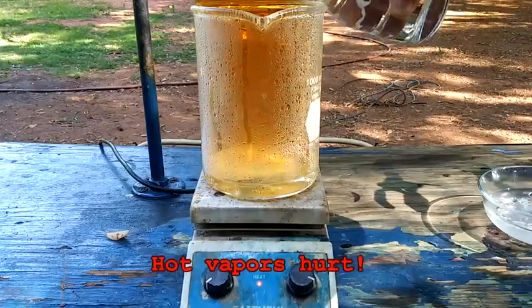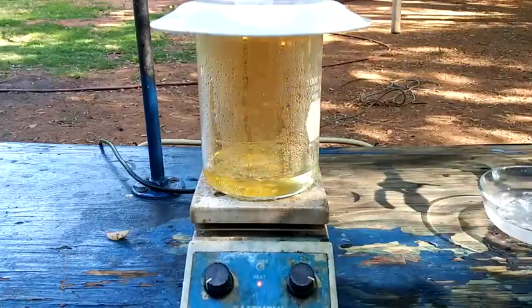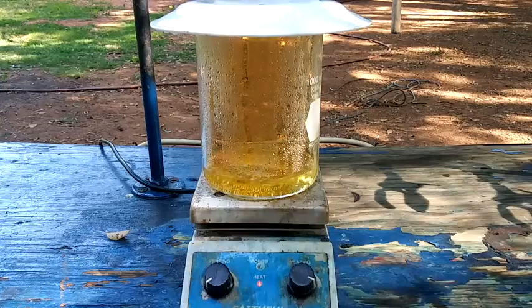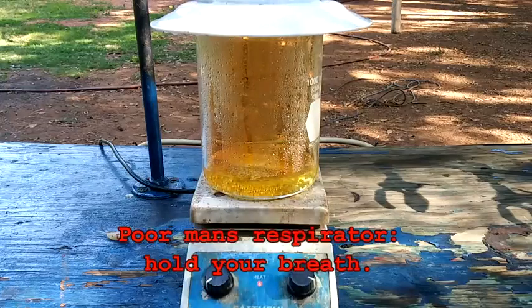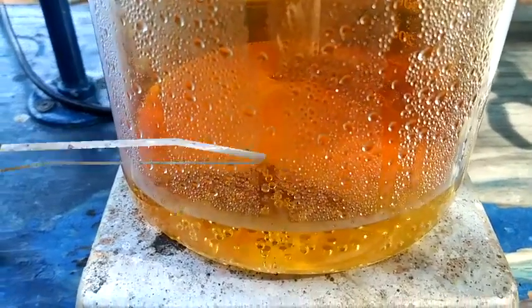Yeah, okay. There we go. Not breathing was the crucial part of that whole thing. Alright, while we've got it for a minute here, before the gas comes back, you can kind of see what's going on in there.